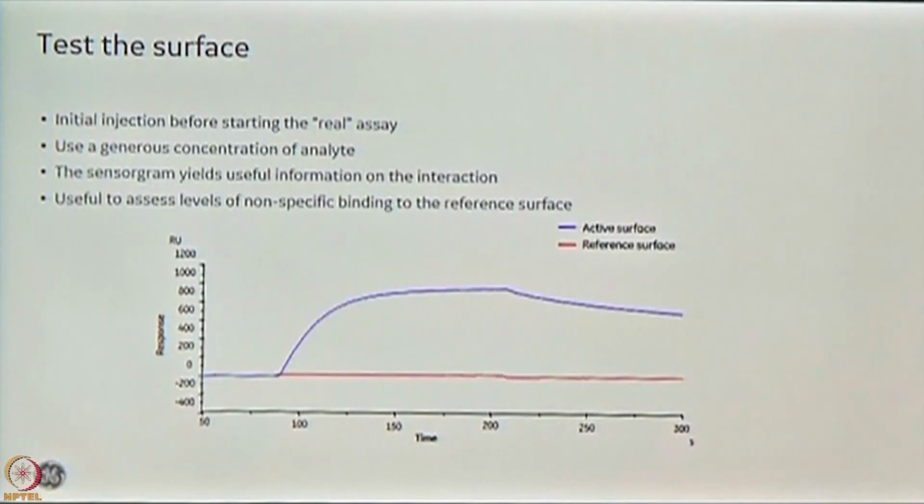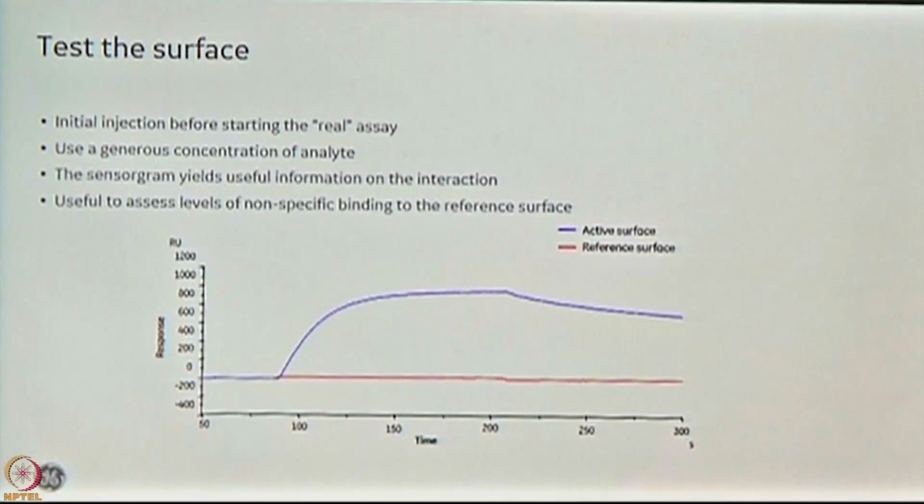So you run 2 different concentrations, low and high. First you get to see the shape of the curve, which gives you a lot of information, like we discussed. You get to see that it is exactly what you were expecting. The other thing is you see a dose dependency, right, a low concentration, a higher concentration, you see a dose dependency.